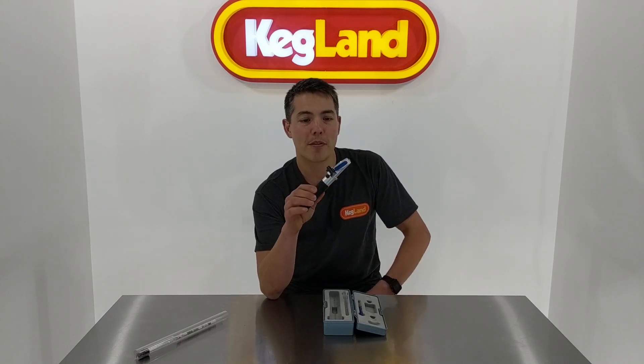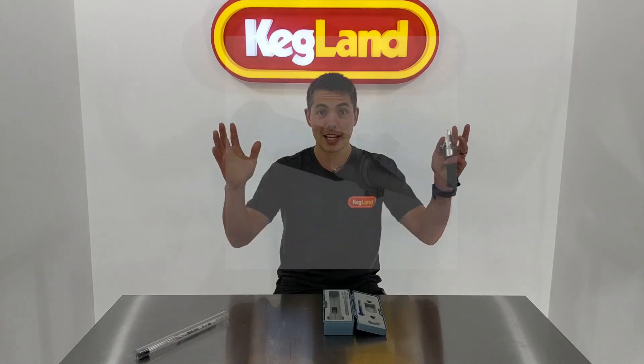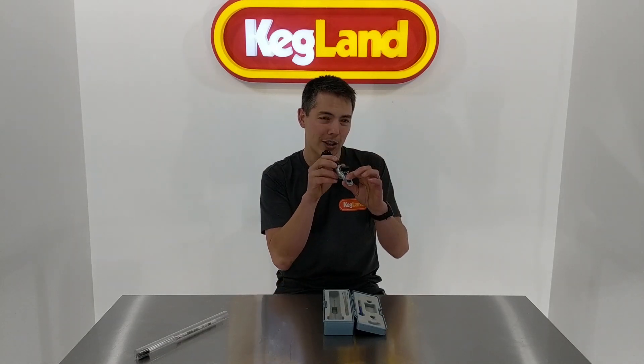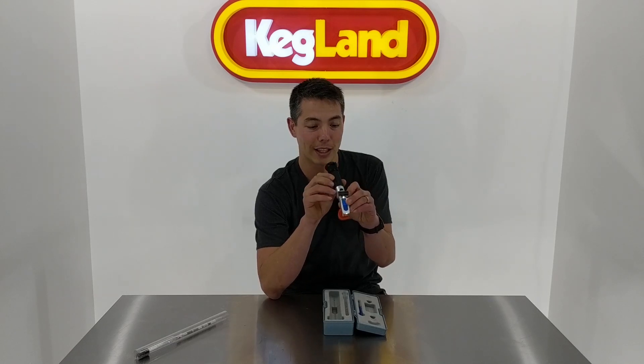These new ones have a little LED light on the side, which is really handy. The older refractometers were okay, but the issue was you didn't always have a perfect light source. If you're indoors or brewing into dusk, the ambient light just isn't bright enough to get a good reading — you look into the lens and it looks a bit fuzzy. These new LED ones are fantastic: you hit this button on the side, it illuminates the lens, and you get a really nice sharp line which is very easy to read.